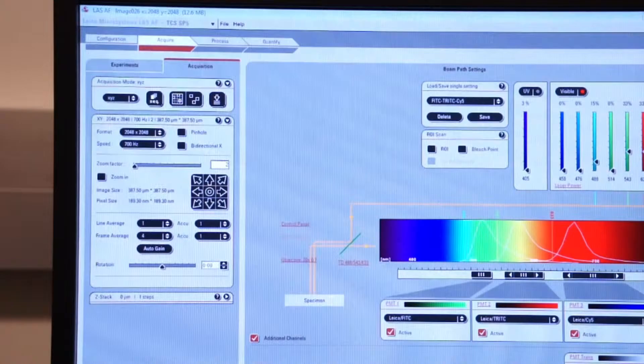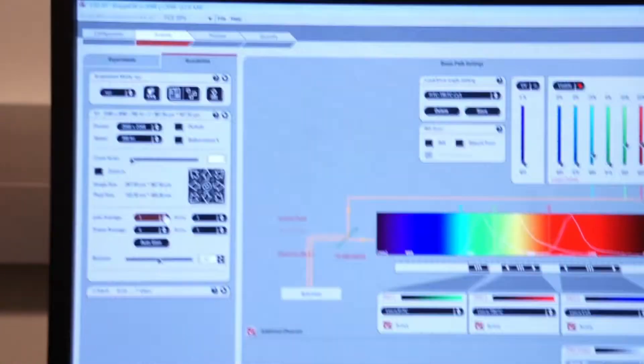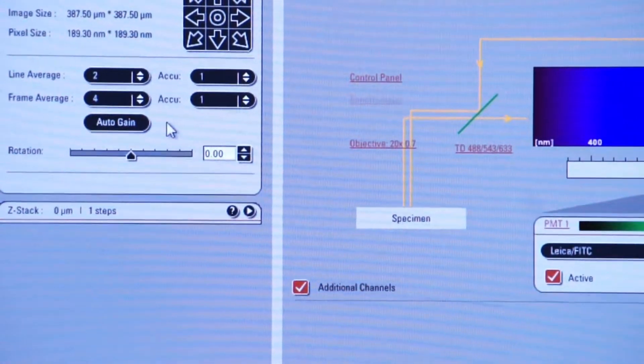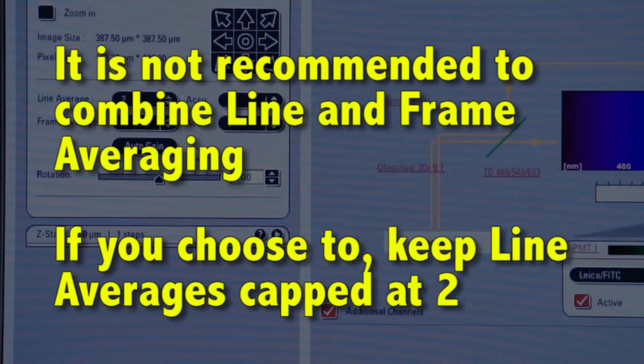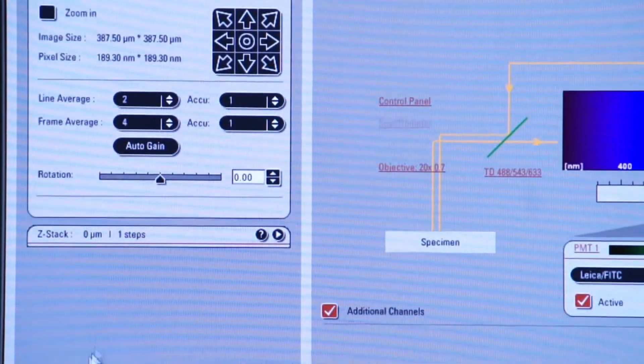I would say only select maybe two scans per line and more scans per frame. So let's click on capture image, watch the image on the screen.